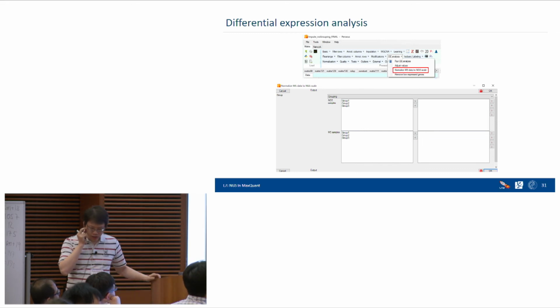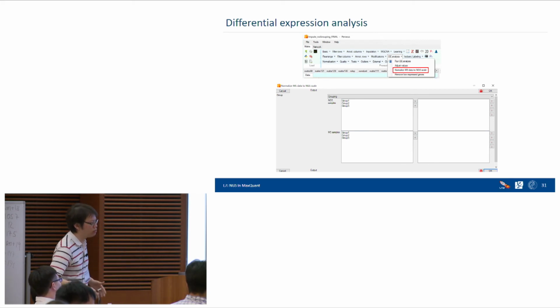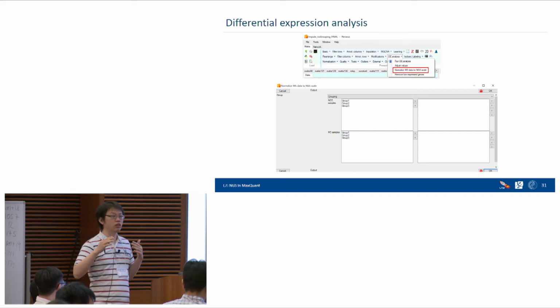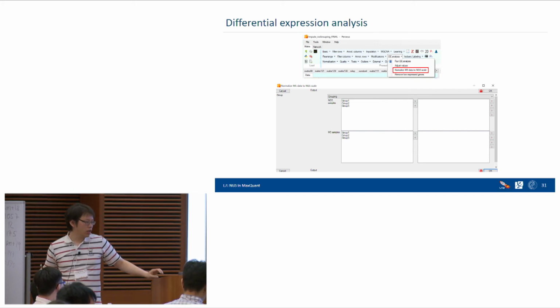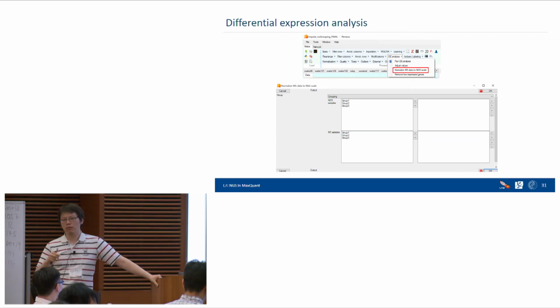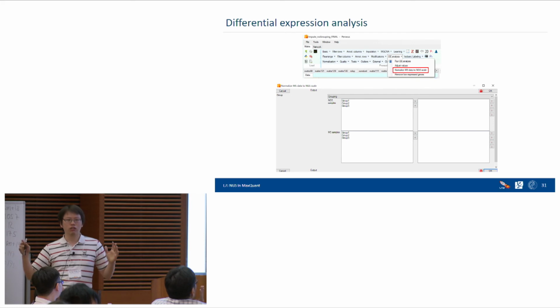Okay, and then we also can do something to normalize the different omics data. For example, proteomics data and NGS data have totally different ranges. In NGS data, sometimes we get hundreds of reads mapped on the genes or 1,000 reads. But in mass spectrometry, you can see like 10,000 or even 100,000 of intensity. So this range is quite different.